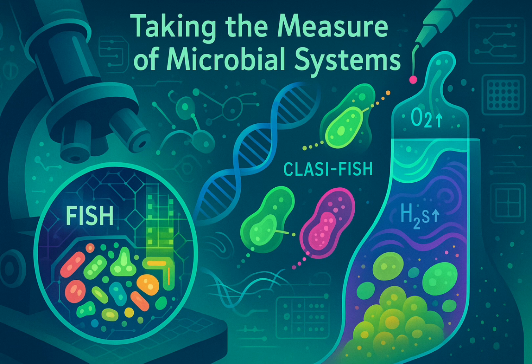Okay, so many of these techniques, sequencing pools of DNA, measuring bulk gas changes, they look at the community level. But what about getting down to the nitty-gritty? What's a single cell doing? Especially one you can't culture. That seems like the real frontier. It absolutely is. Linking genetics and activity right down to individual, uncultured cells is where a lot of the cutting-edge work is happening. And NanoSIMS is one tool for that.